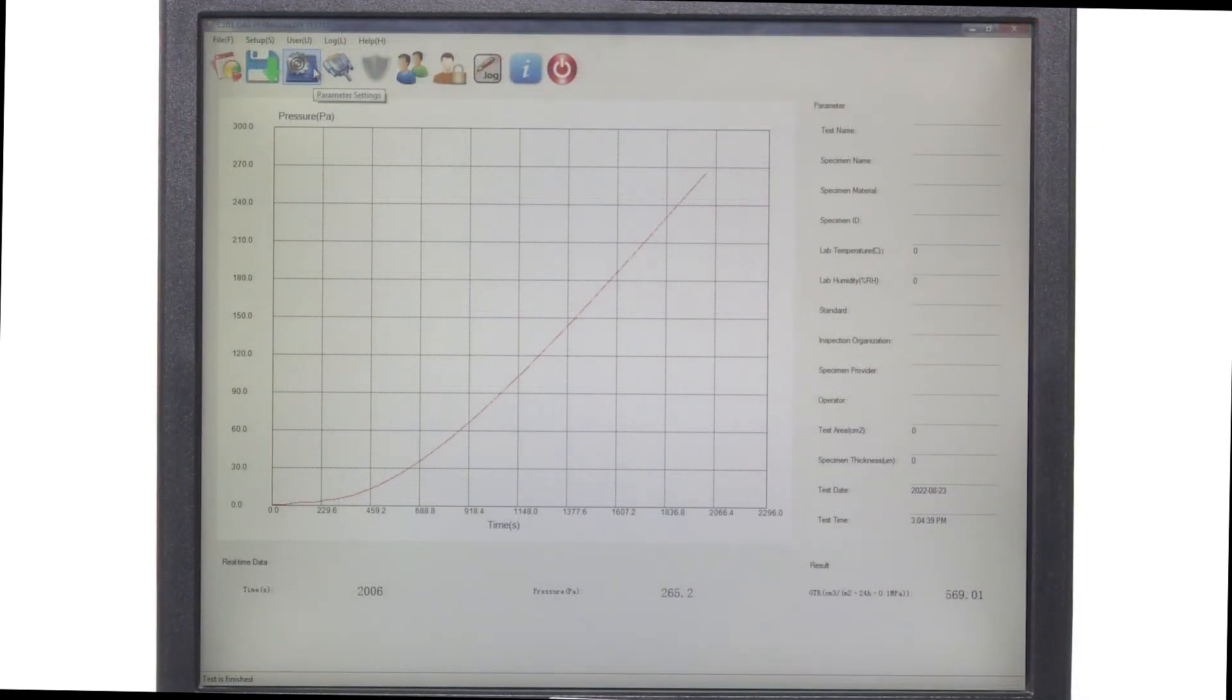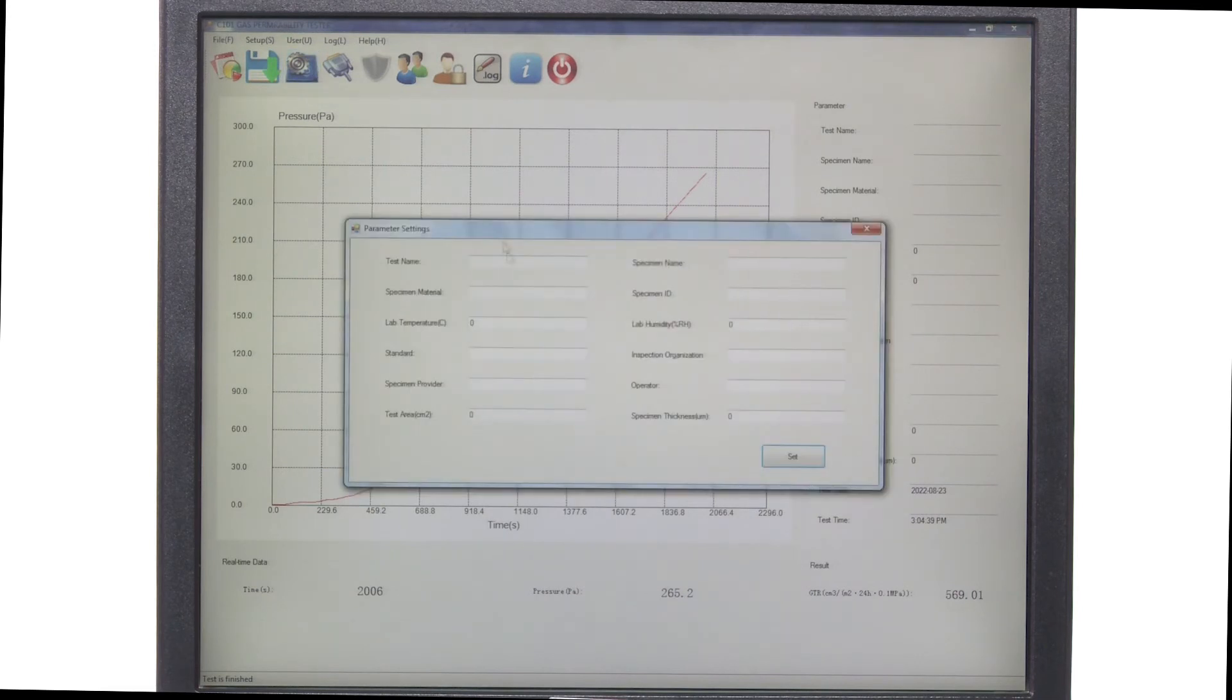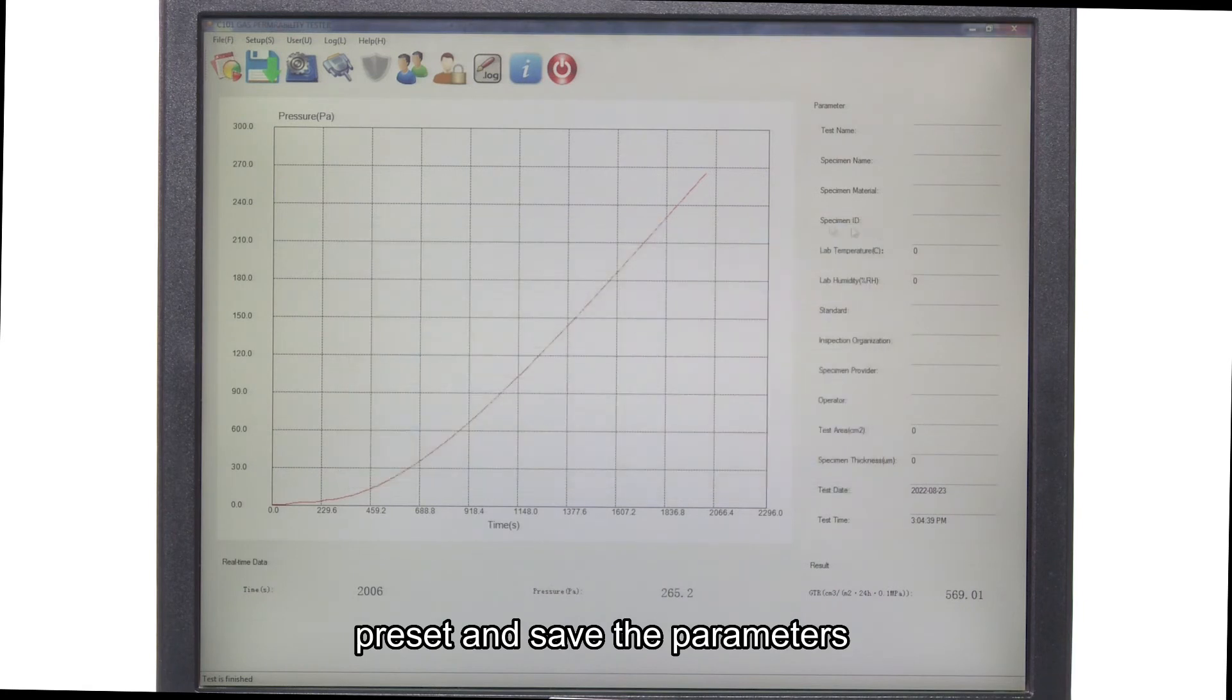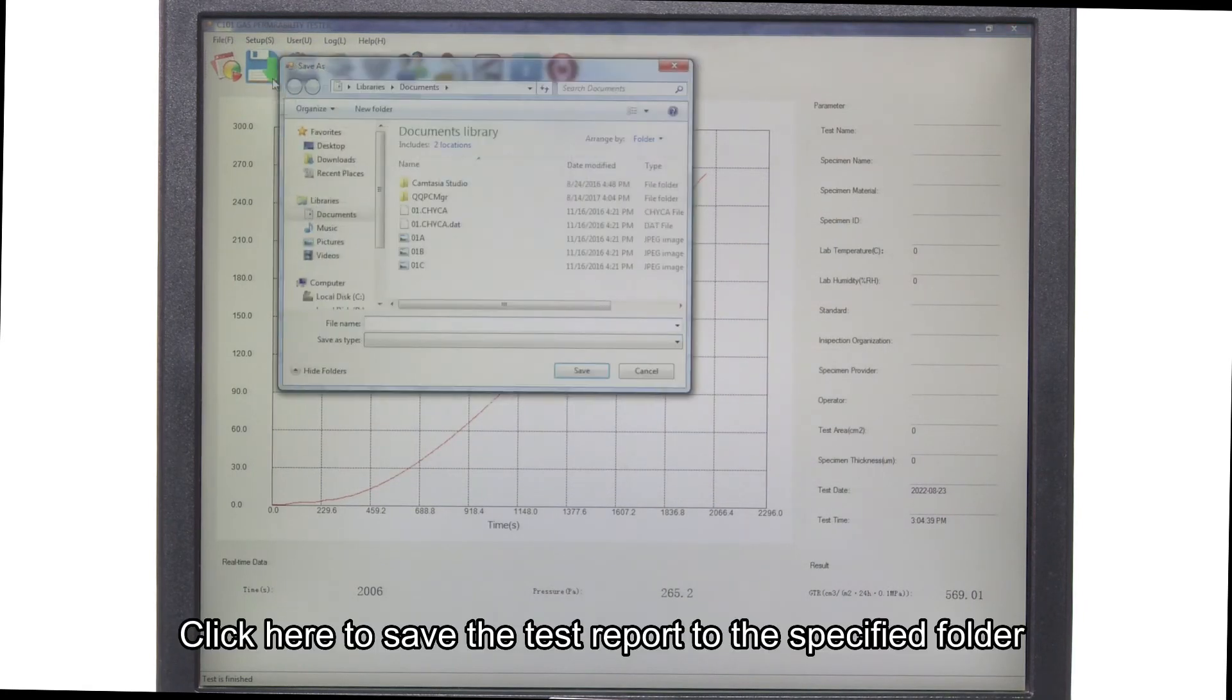On the toolbar here, click setting to enter parameter setting. Then, we can select the item, preset, and save the parameters. Click here to save the test report to a specific folder.